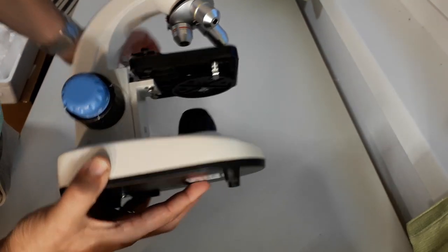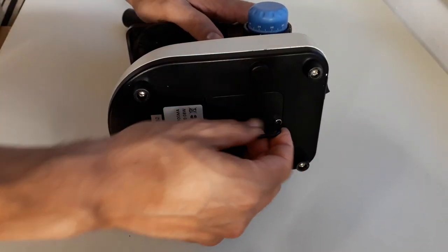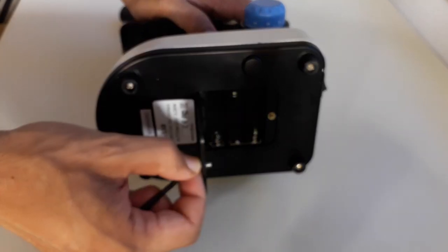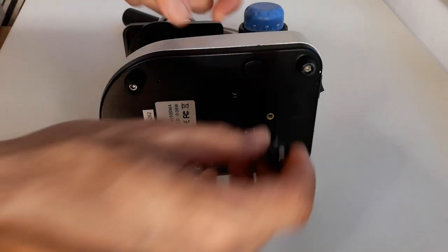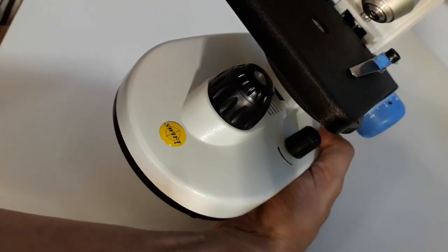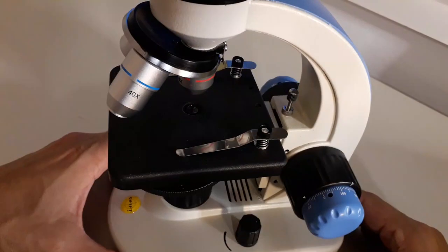The microscope itself, as I mentioned before, can be operated with a battery. So I'm using the supplied hexagonal wrench to open the battery compartment. As you can see, there is room for three batteries, which I'm dropping in right now. And basically then the microscope is already ready for operation. When you switch it on, you can see that the light turns on like this.